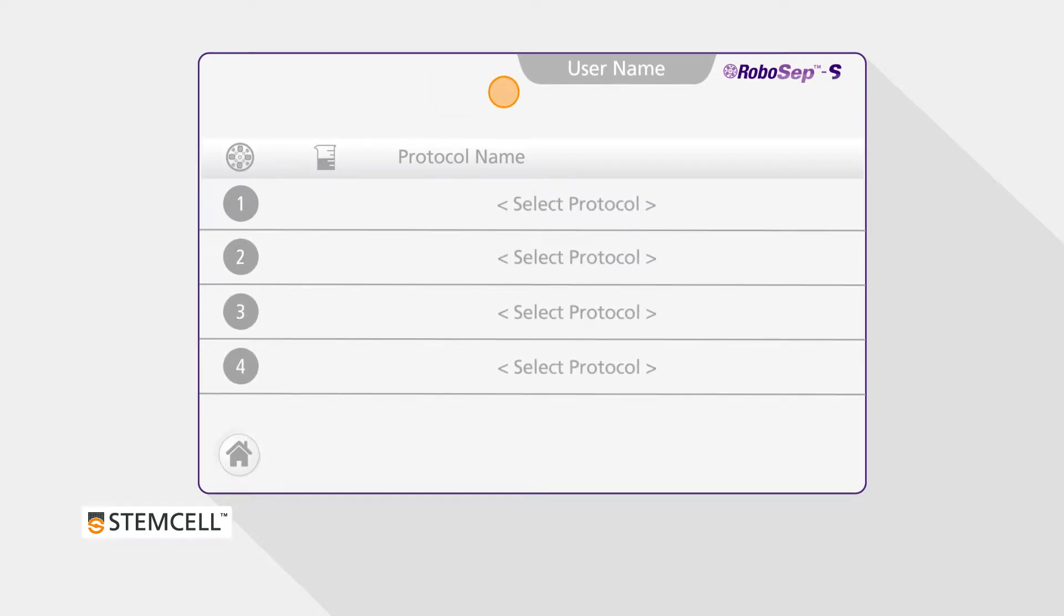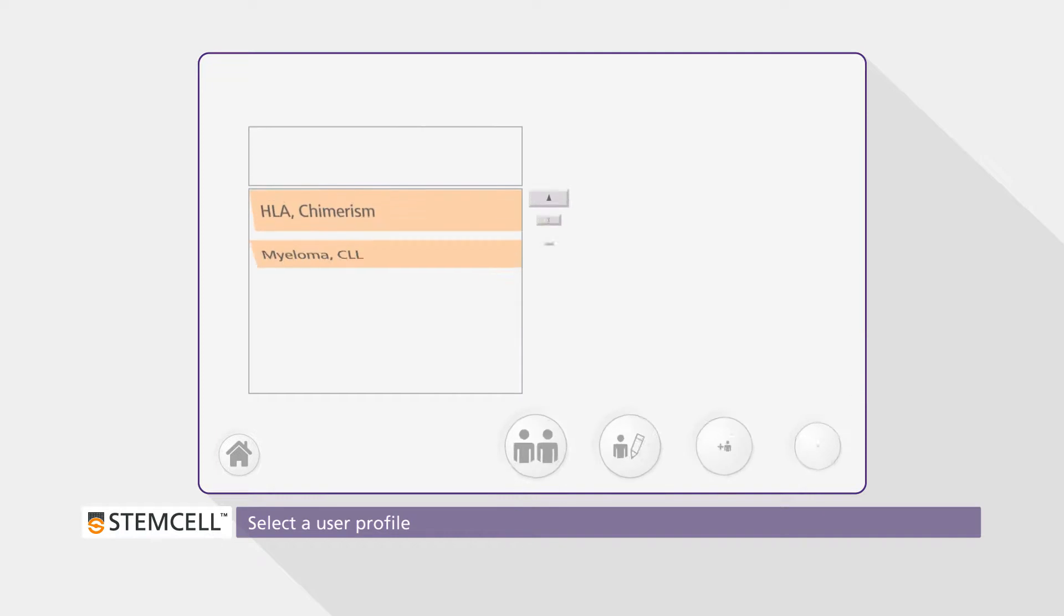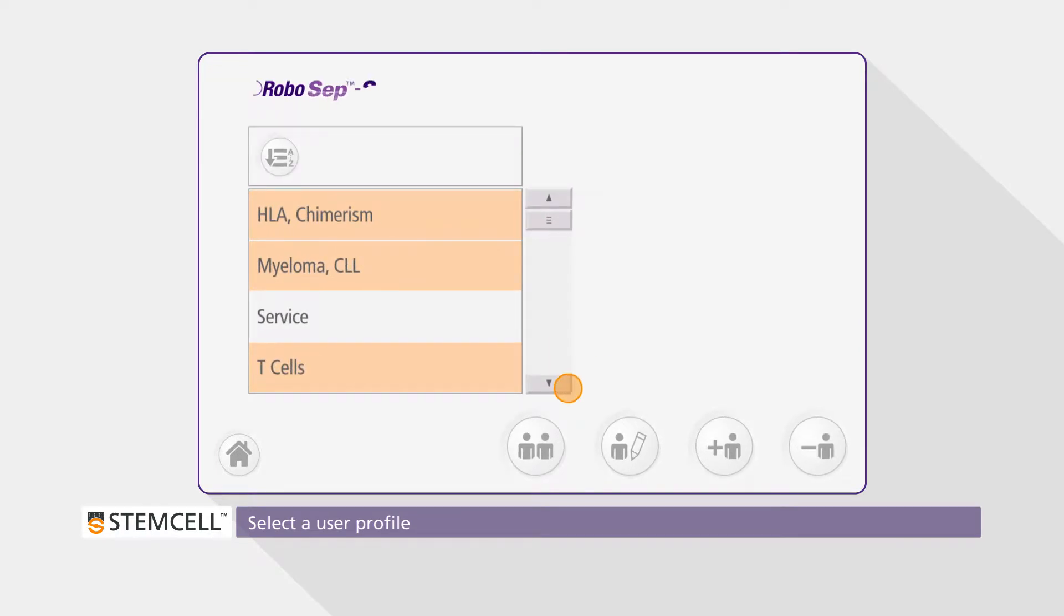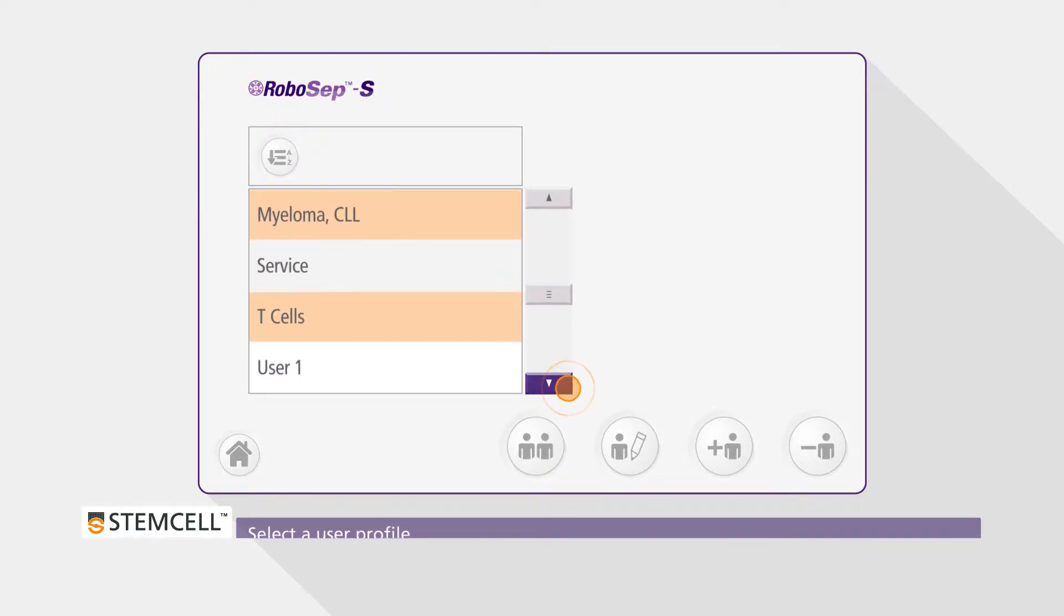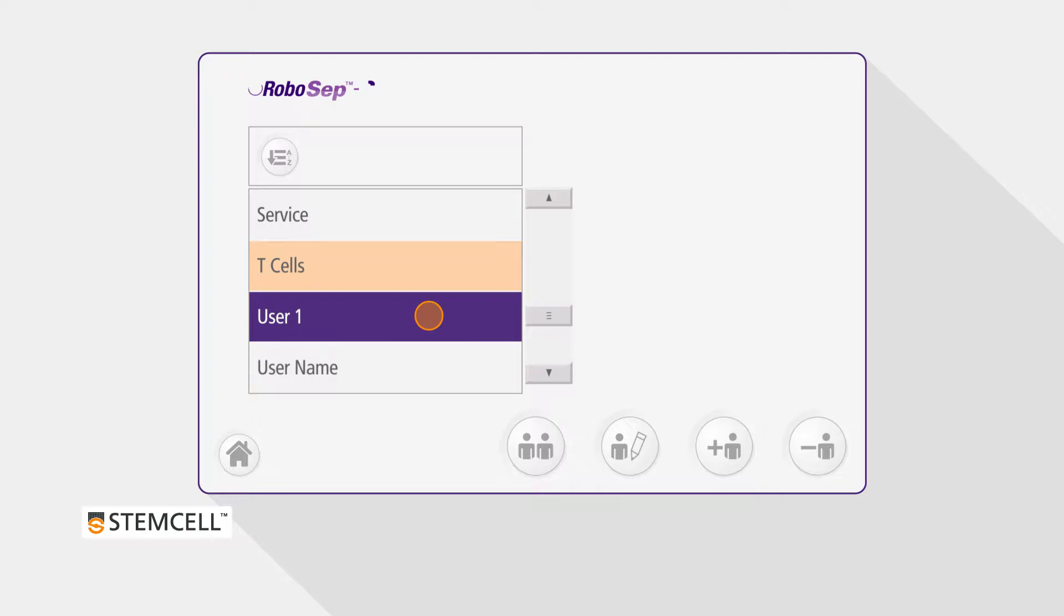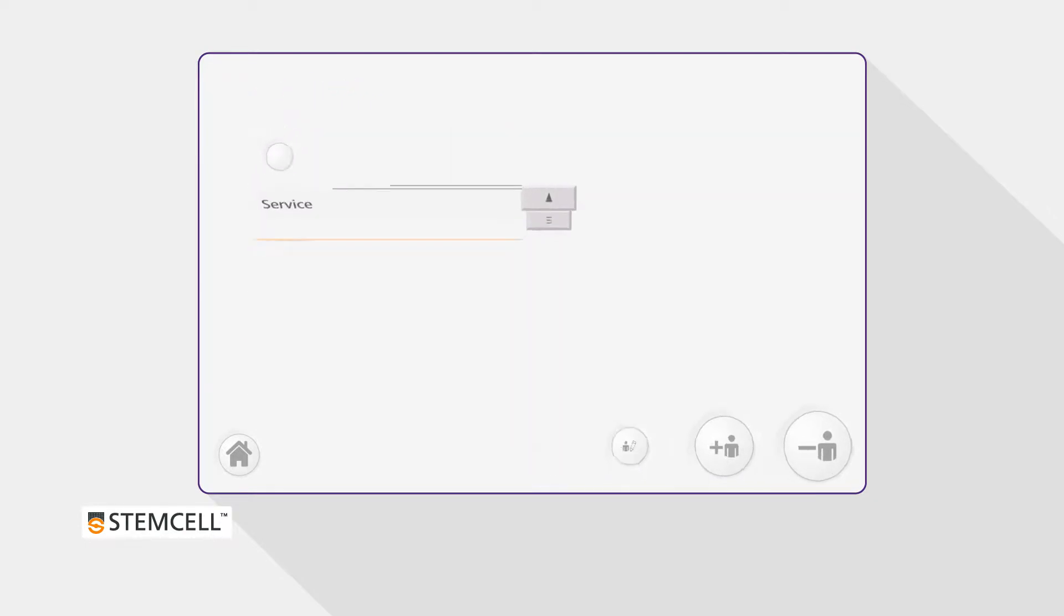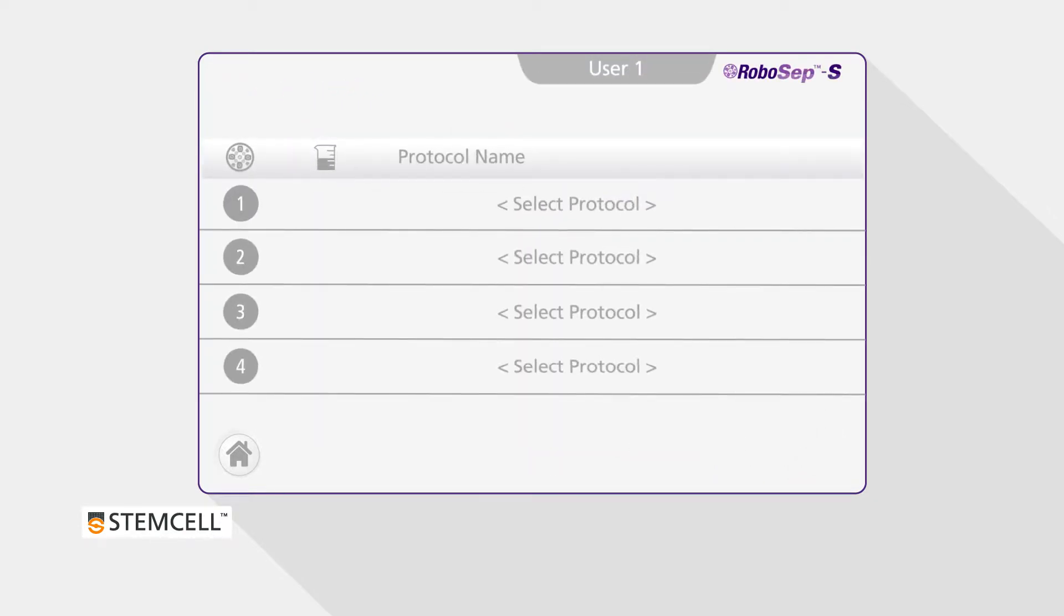To select the desired protocol for your run, first select your user profile, and then select the corresponding quadrant.